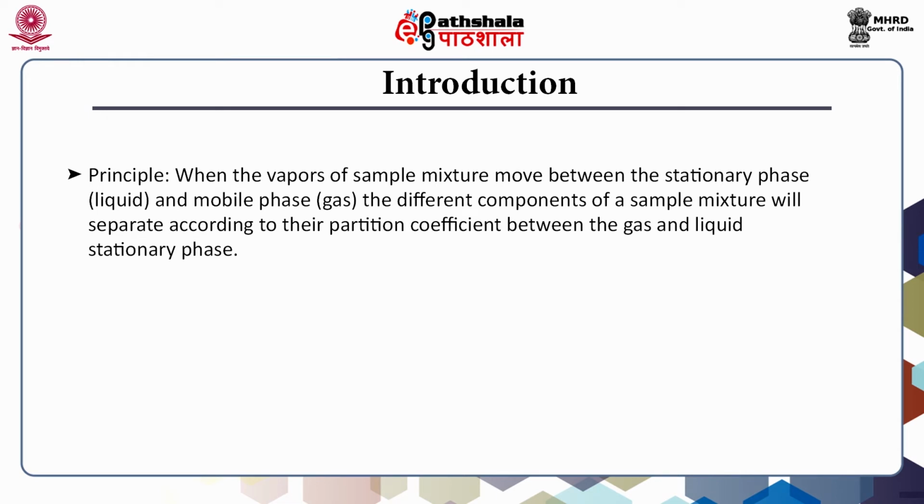So, it involves two active parts. One is the mobile phase, which is an inert gas, and another one is the stationary phase, which is a liquid coated on a solid support like silica.